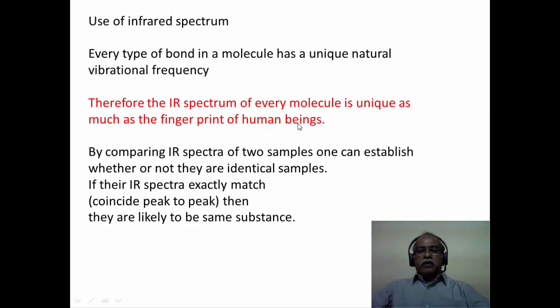Let us look at the use of infrared spectrum. Every type of bond in a molecule has a very unique natural vibrational frequency. Therefore, the infrared spectrum of every molecule will be very unique, just as much as the fingerprint of human beings. And this is what makes infrared spectroscopy a very valuable tool.